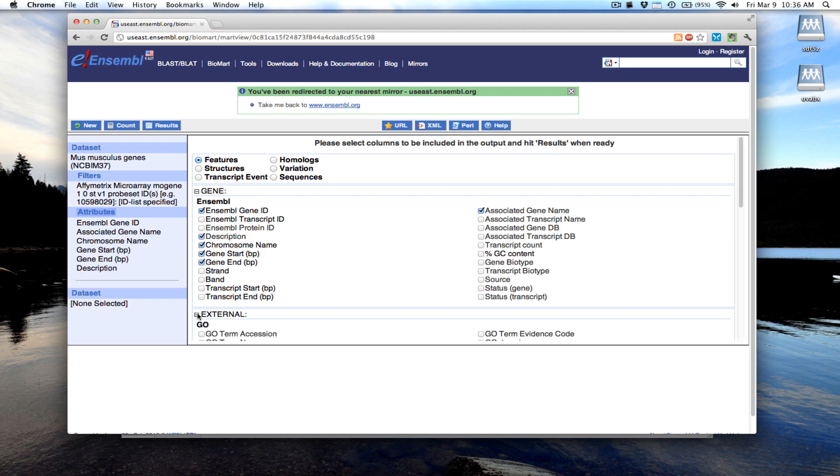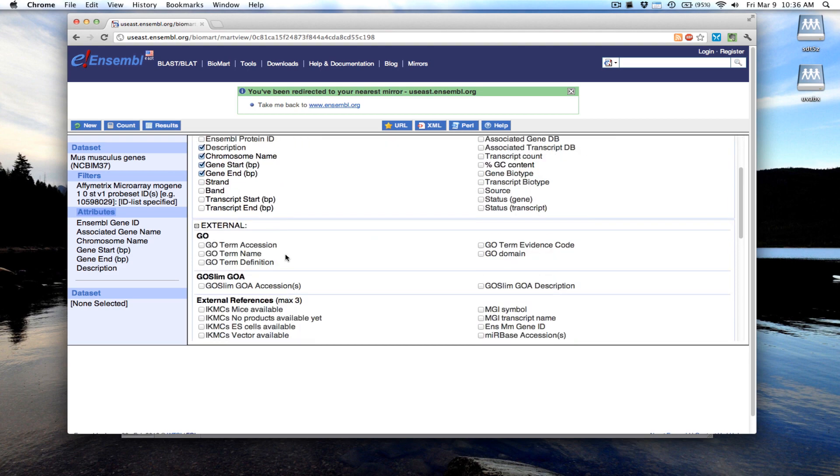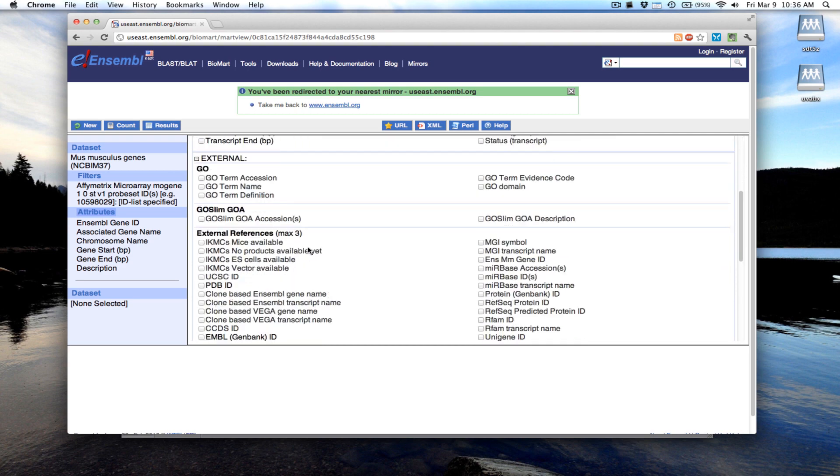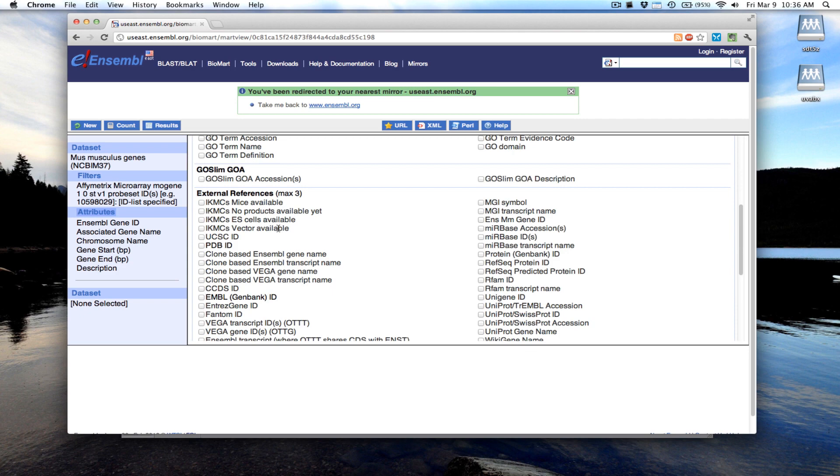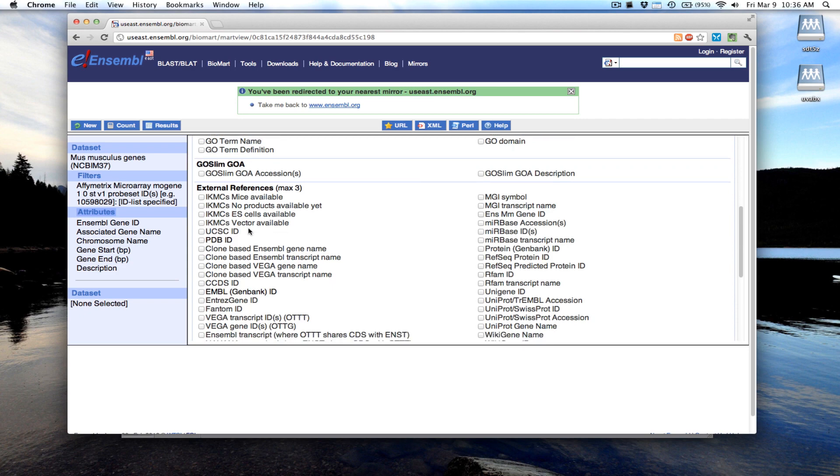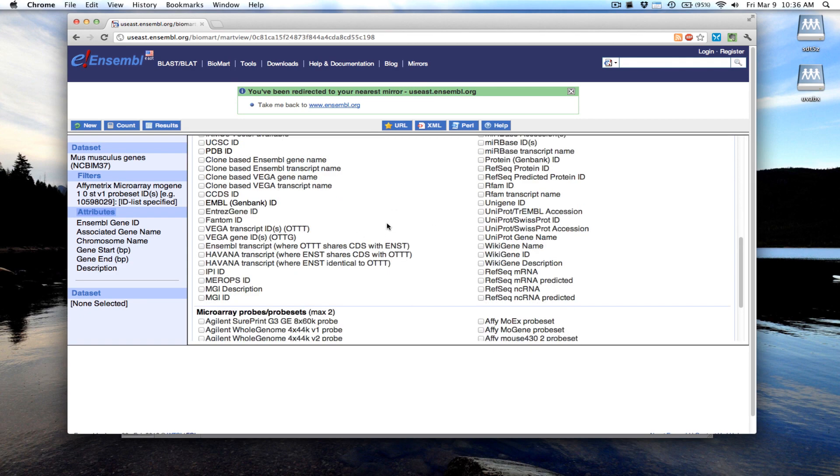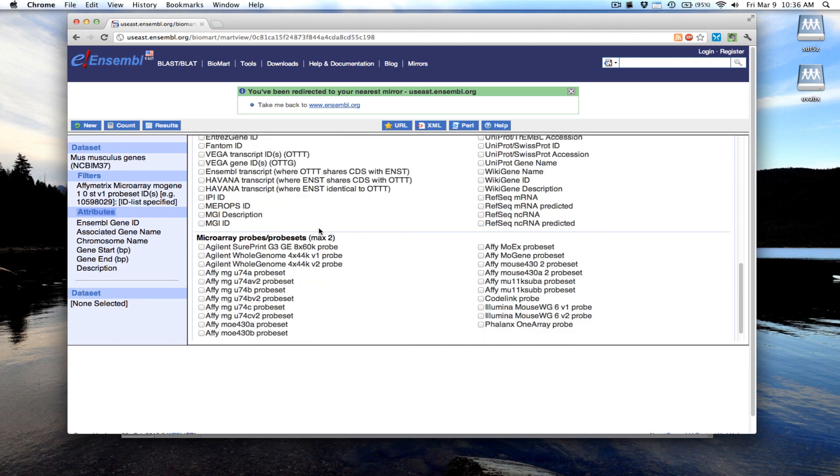We could come down here and select other types of annotation. We can annotate these with GO terms, gene ontology terms.